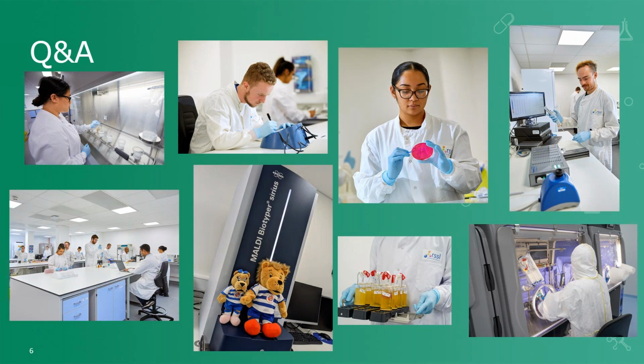So you need to use a detergent to do pre-cleaning, but after the disinfectant application, if it's not a low residue disinfectant, then water's probably better. Otherwise you get yourself into a conundrum of ever-growing residues.